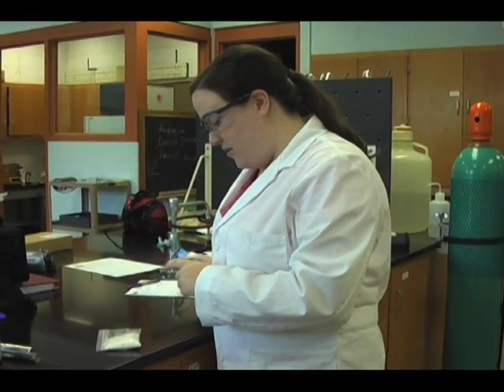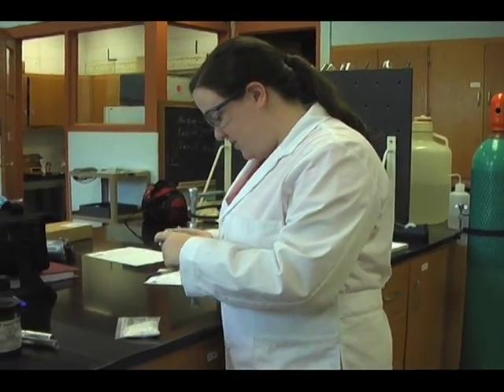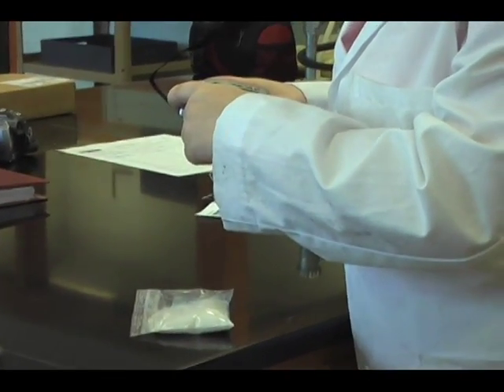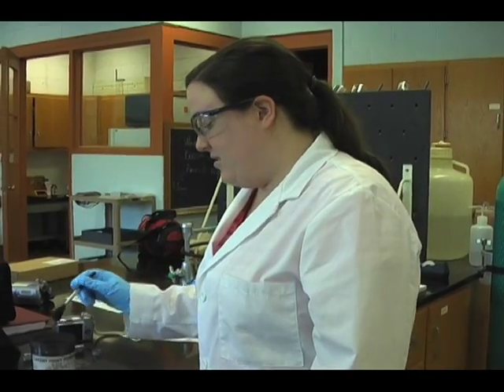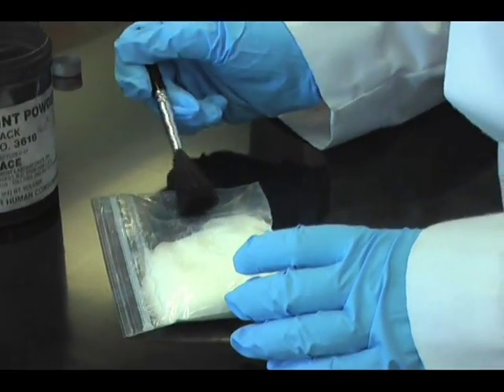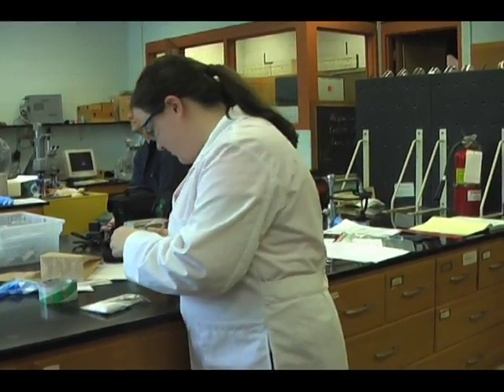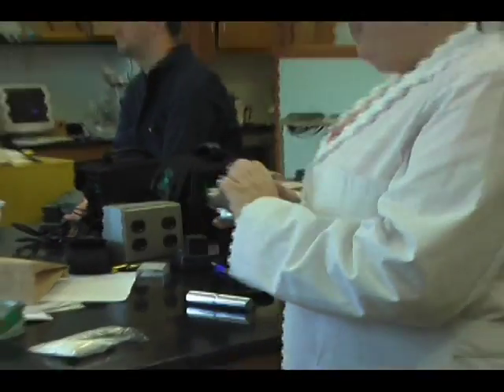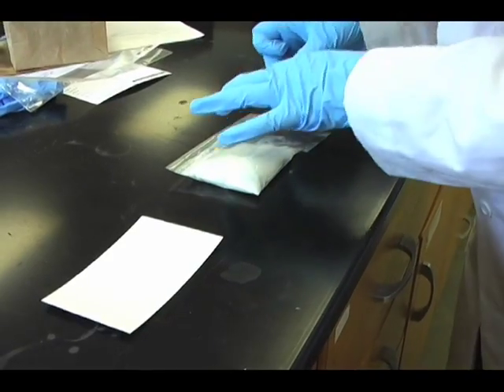Now we're taking photographs of the prints before dusting. Now we're dusting for fingerprints. We're taking a photograph after that. Now we're lifting the fingerprint.